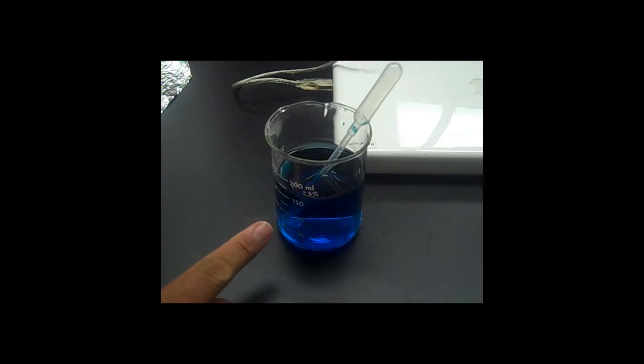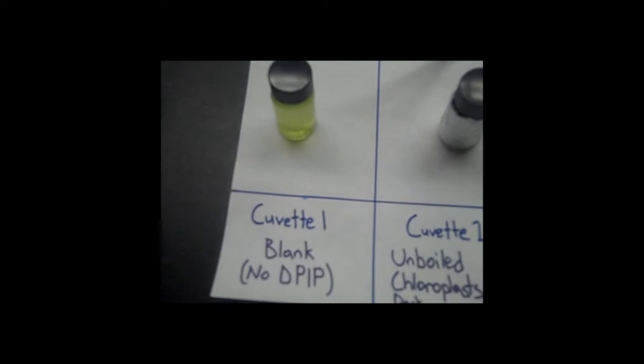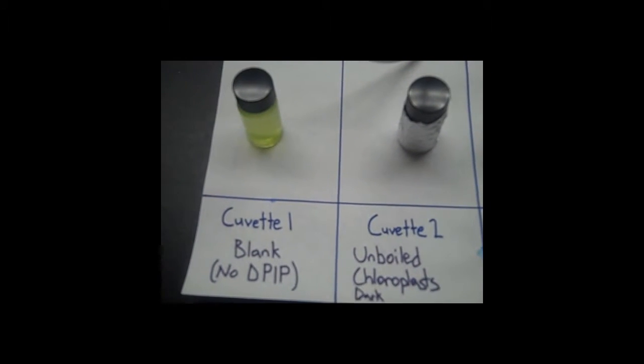This is the DPIP. Cuvette 1 and Cuvette 5 are the controls. Cuvette 1 contains no DPIP. It only contains the chloroplast and buffer.